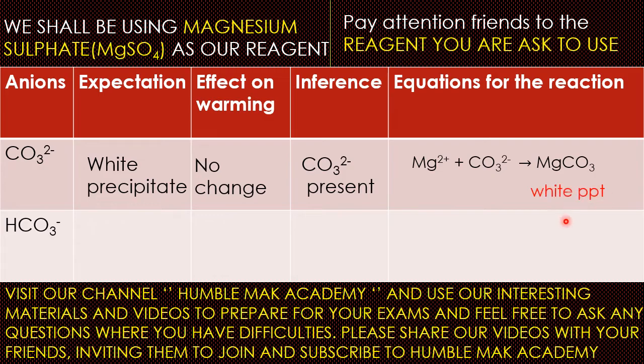And this is a white precipitate. Okay, this PPT stands for precipitate, so it's a white precipitate.